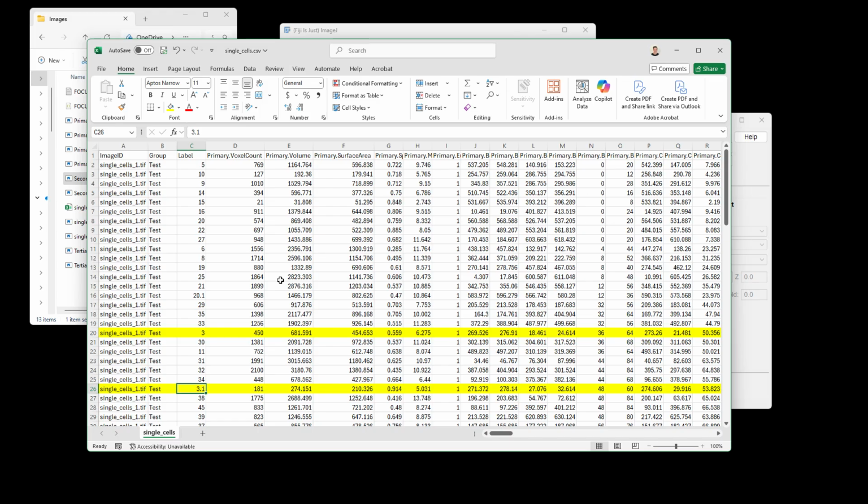So in summary of this particular discovery here, we have batch process friendly data with matching nuclei to cell to cytoplasm, where a single row represents a nucleus and its parent cell and various components therein.